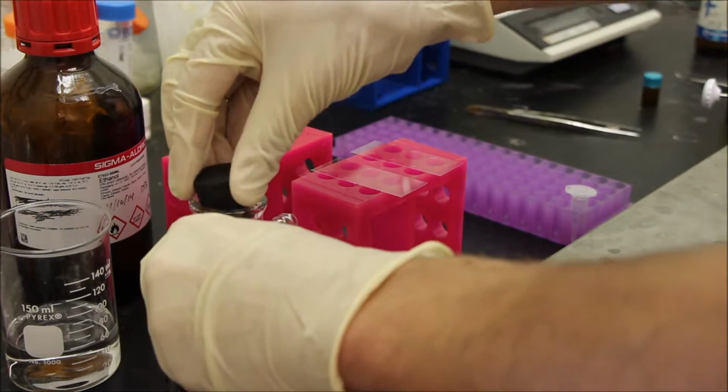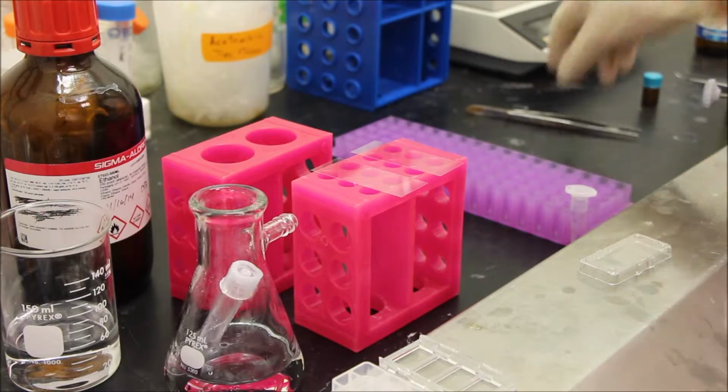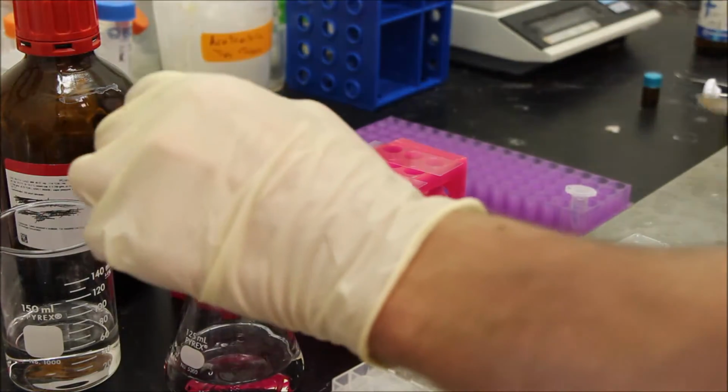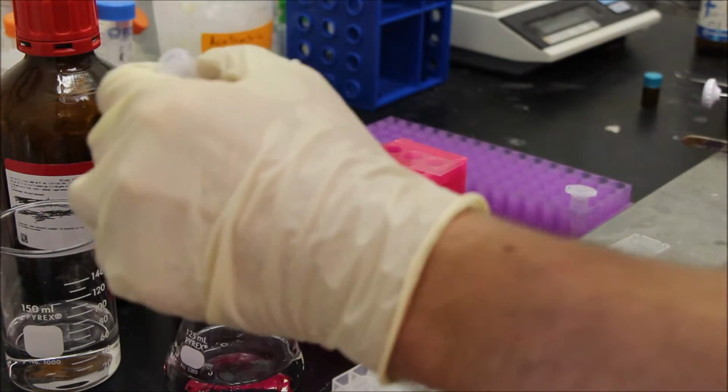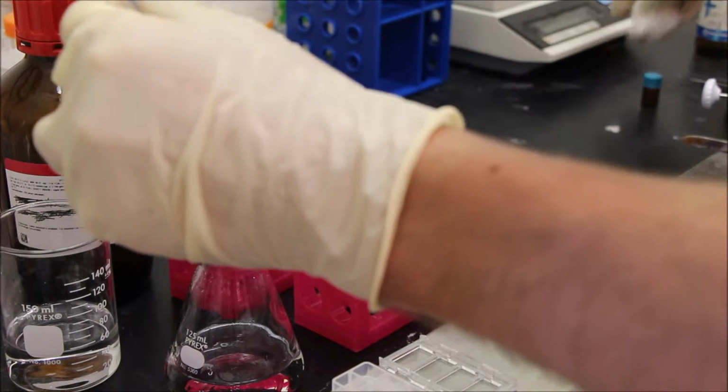Alright, so our solution here is done. I'm going to take it out of the sidearm flask. I like to dab it down with a Kimwipe to get rid of excess water.